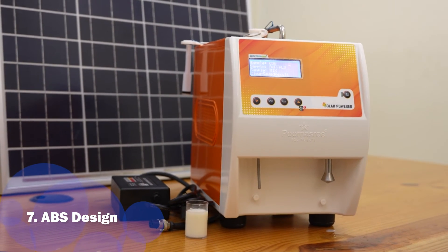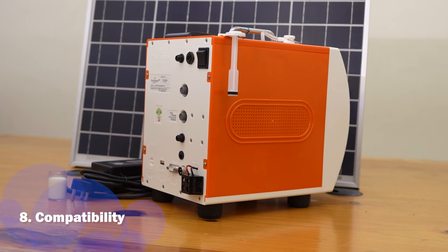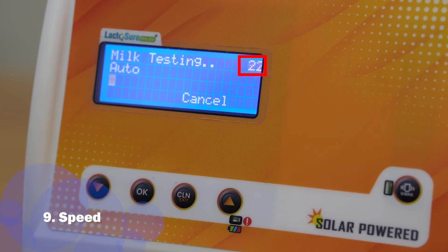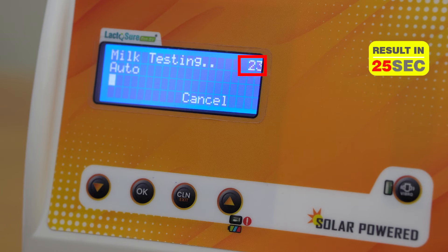A strong, rigid, and well-finished ABS body gives a good finish. It is compatible with all weighing scales and software currently available in India, and it is the fastest analyzer with a testing time of just 25 seconds.